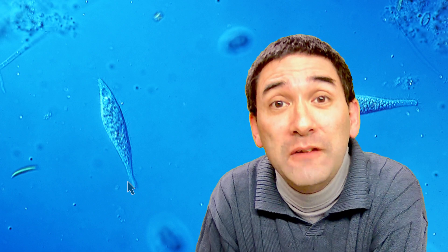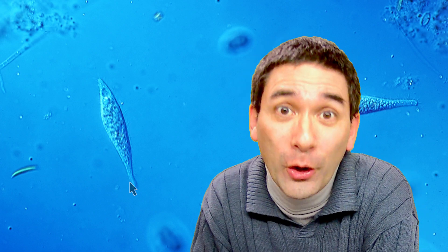This here is the ciliate Amphileptus. Here, this is the front part of it and that's the mouth, and we're just going to see in one minute how it is able to devour a fairly large cell. It's actually supposed to have also two macronuclei which are a little bit difficult to see. I don't know if this one here in the back could be a nucleus. What is important is that Amphileptus is actually a pretty aggressive hunter-predator, and in my water sample I found several of them.